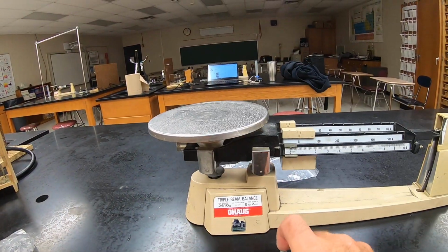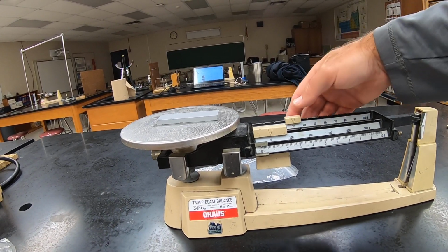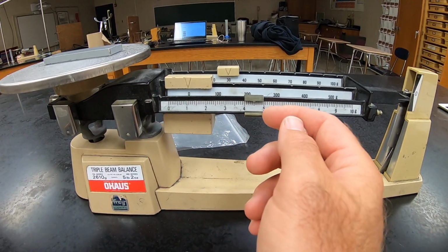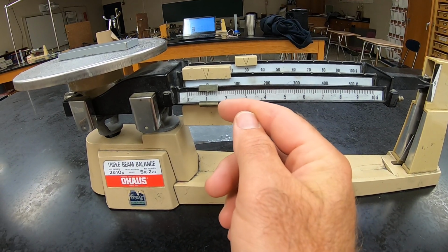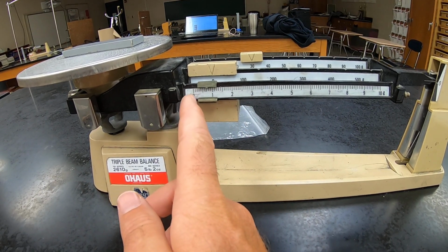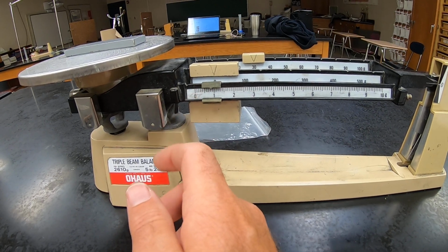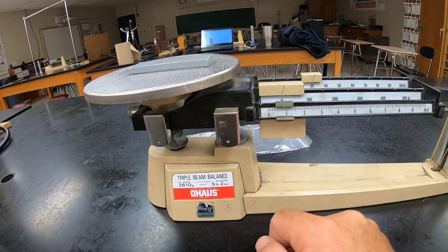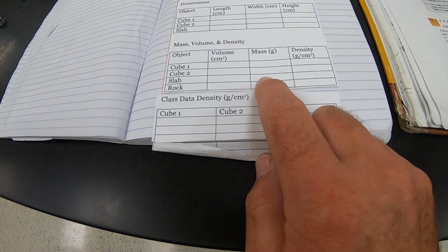I'm going to zero that out, put the slab on. Okay, so it's 30 something. It's almost 30.8. We'll call it 30.78 for the mass of the slab.